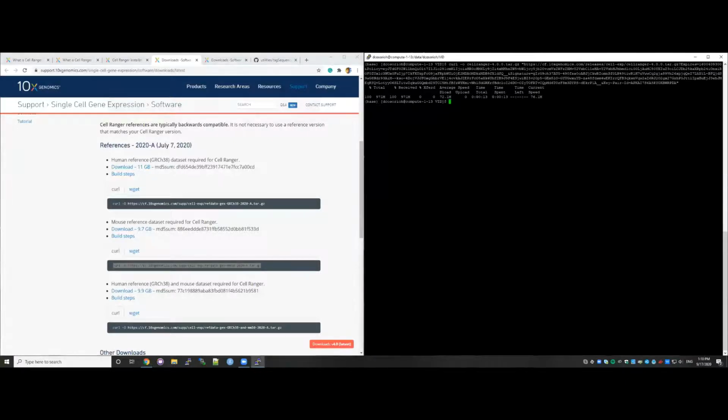I see. Okay, so I download the file, this one, Cell Ranger, and I also download the reference data for the Mus musculus. I place the FASTQ files in this folder, FASTQ, and I downloaded the file for the tdTomato sequence, that is the transgene I'm going to add into the reference, and the GTF file. These both, I put them available for you in my GitHub.